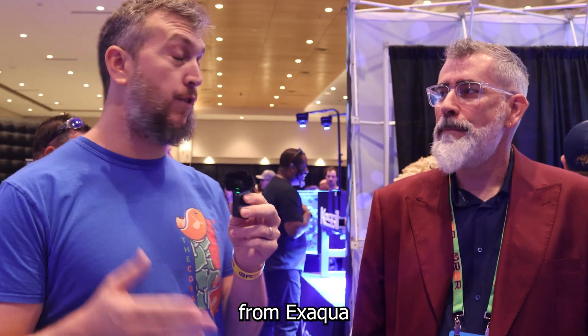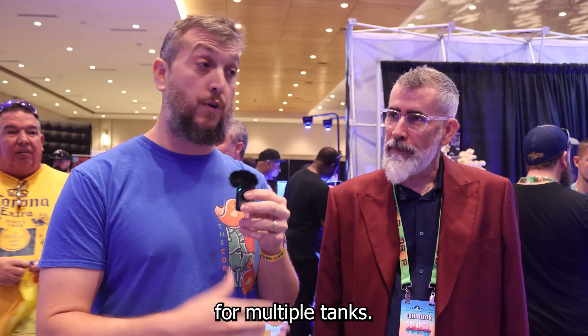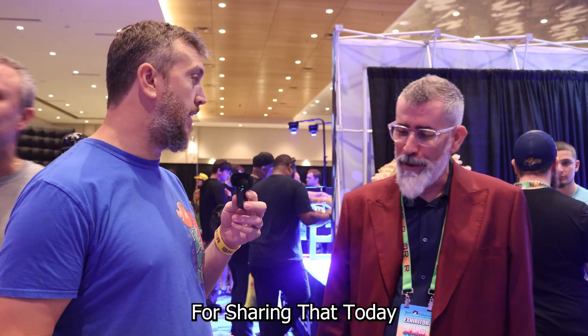That is the photometer from X-Aqua — a very cool device that keeps track of all your tank parameters for multiple tanks, making it very, very easy. Thank you so much for sharing that today.